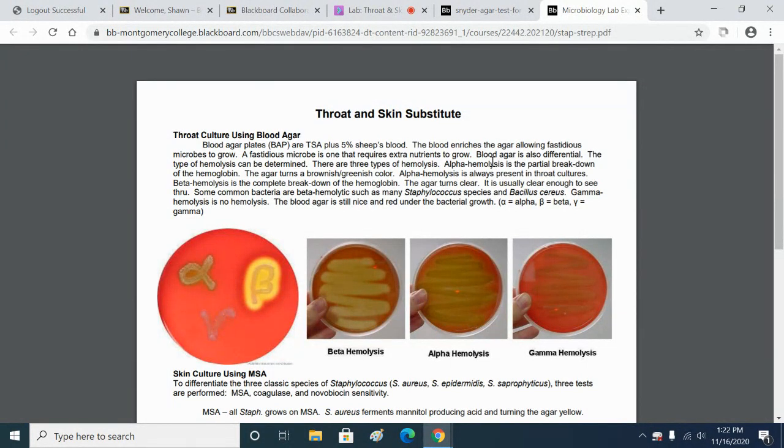And the Bacillus colonies would normally be relatively large colonies. You can easily recognize them. The Staph aureus is kind of an intermediate sized colony. And then if there were really small, bright white colonies, that's Streptococcus. But it could very well be an organism, Streptococcus mutans, which is found on people's teeth.